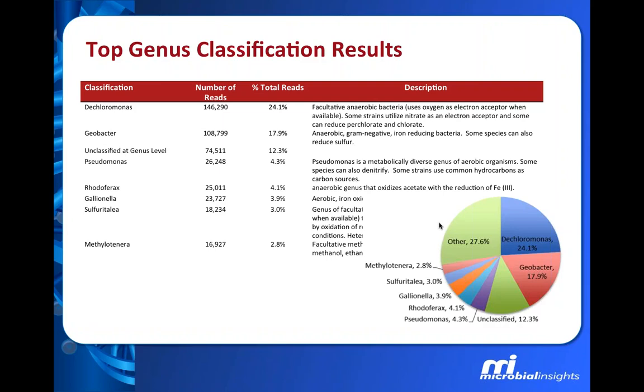We can overinterpret our results and jump to wrong conclusions, because the descriptions in this are generalizations about a genus that are based on what's available in the literature. By generalizations, I mean we're talking about traits that are common among the isolates described. This description often relates to environmental remediation, and we may talk about interesting abilities or phenotypes that characterize some strains in the genus and species that we've identified. While these are noteworthy and interesting, they are by no means universal to that genus as a whole.